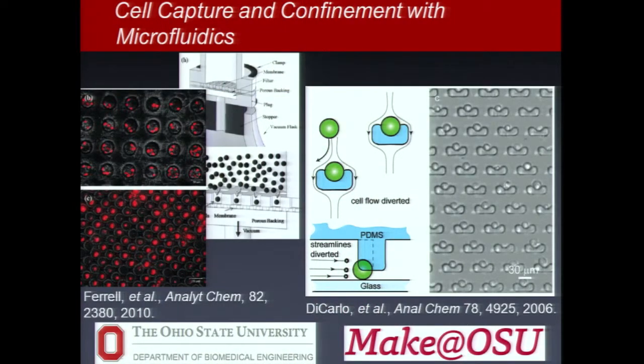In terms of physically doing separation, there are many techniques that people have come up with. This is an example of flowing cells into an array of traps. A cell will come in, and if there's not a cell sitting in one of these traps, it has a certain probability of being contained in the trap. Once another cell gets in there, though, the second cell coming in would generally not be trapped. For example, this is being used for collection of cells and then culturing them over time.